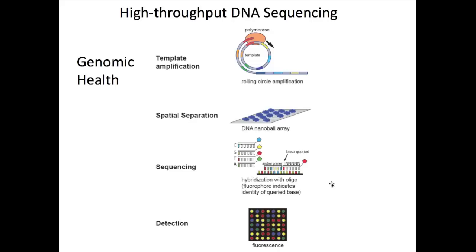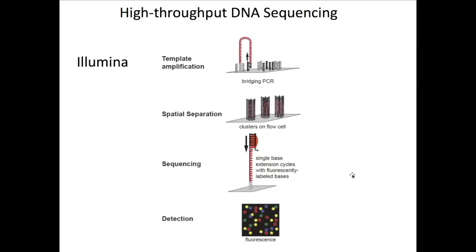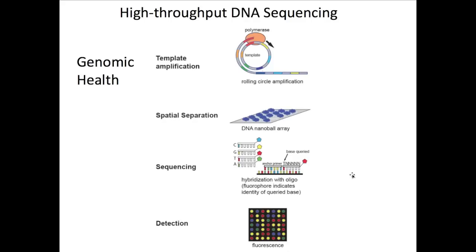So I forgot to give the parameters, but basically the Illumina sequencing platforms at present can generate hundreds of millions of sequences of the read lengths that I specified, somewhere around 150 bases of paired end sequencing, or now up to 250 bases in the latest version of kits for a slightly smaller version of their instrument. This is a vast amount of sequencing capability, and the cost is really quite low. So it's made it feasible to sequence human genomes for not much more than a few $1,000s right now. And similarly, there's been an intense competition between these companies, so the prices have been driven down significantly.